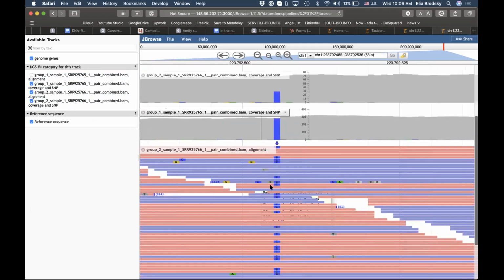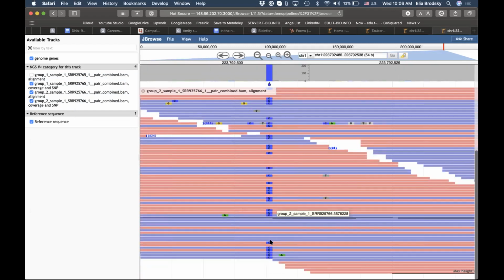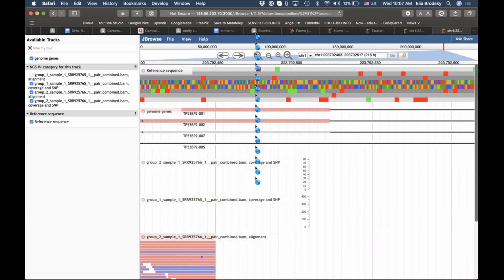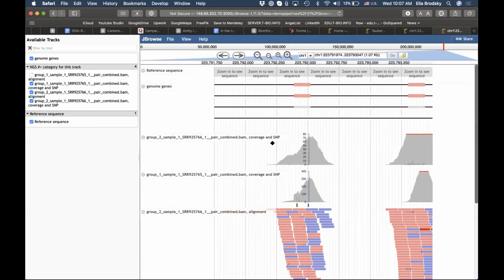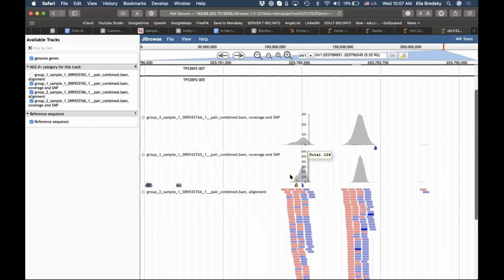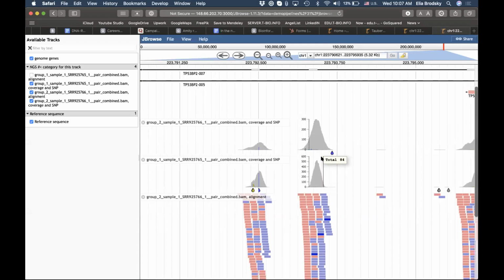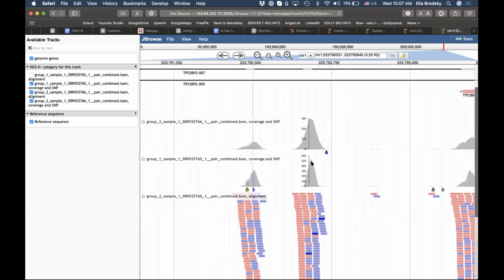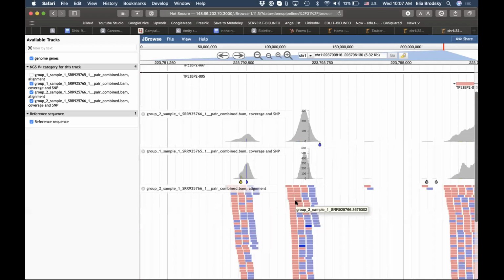And then here I can actually see the nucleotides, and I can see individual positions where I have a change, right? And you can see that this change is identified by this little mark on this level. Now, if I zoom out, I'm just going to quickly zoom out here, you can see that actually only portions of the genome have some coverage. So the coverage of the genome is positioned right here.